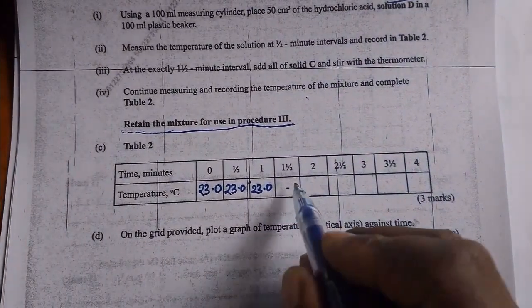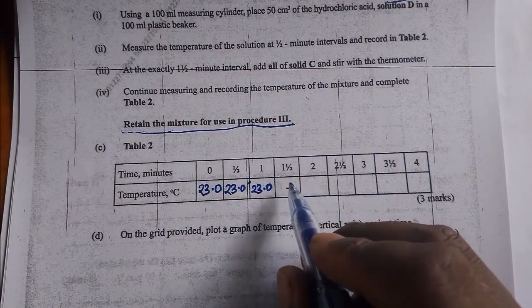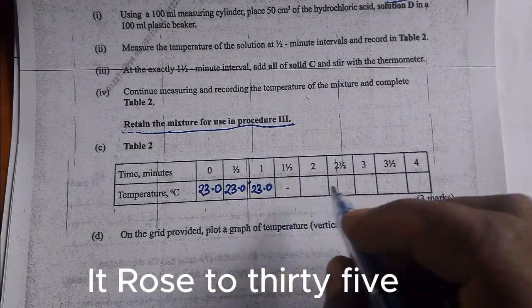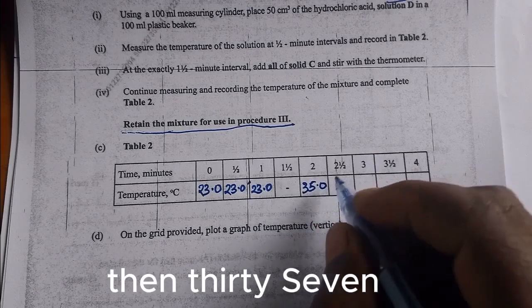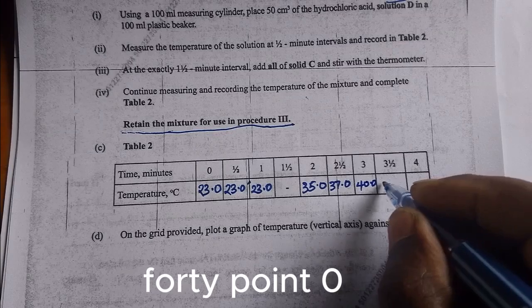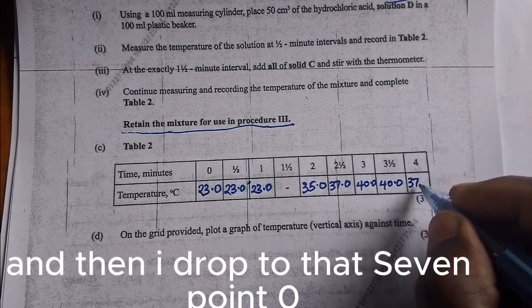Here, this is X, nothing is there. Now, at this point, we add solid C to the solution and the temperature will start rising. So, in my case, it rose to 35.0, then 37.0, then 40.0, 40.0, and then a drop to 37.0.